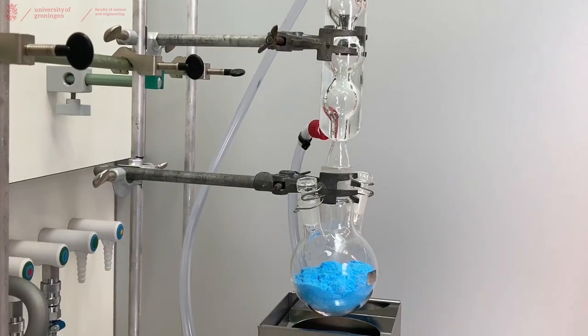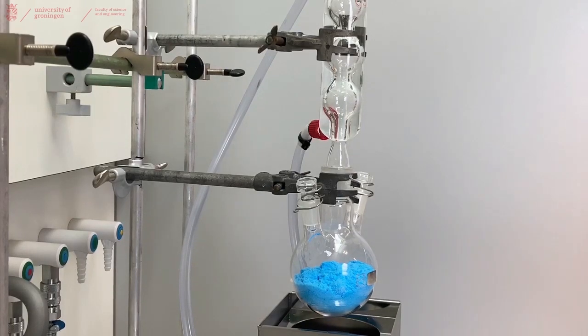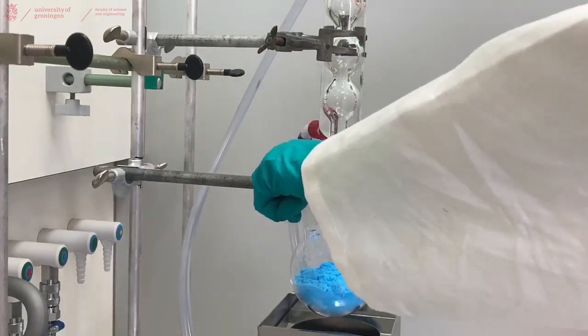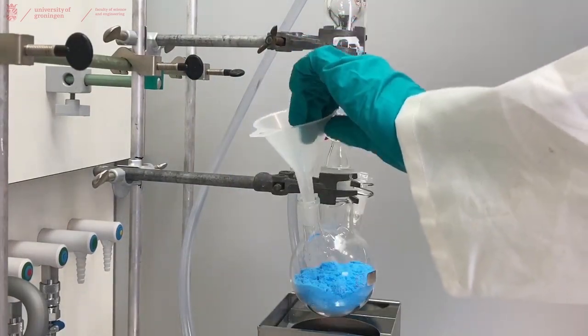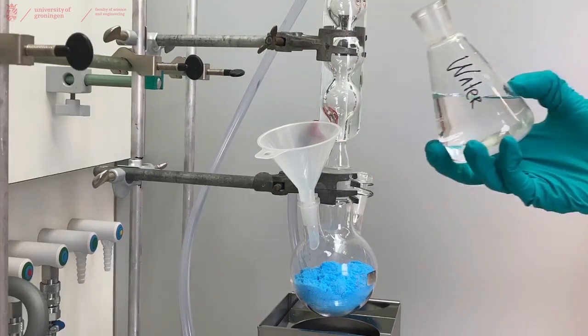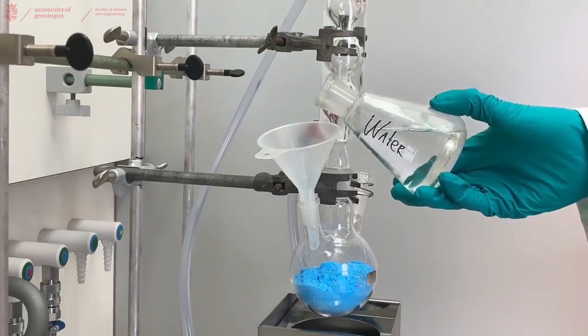So, for this recrystallization I will add my solvent, in this case water, using one of the two side necks. So I'm going to open it by removing the stopper. Now that the funnel is placed on the three-neck flask, I can roughly add 60 ml of water to this copper sulfate and start heating it and see if everything dissolves or not.